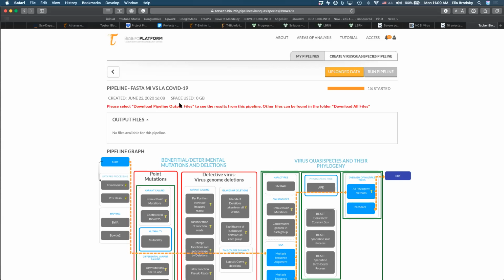So what would be really great for the next time is for all of you to have some sense of how your choices about the data that you want to select are reflected in the results of your analysis pipeline, and what can we ask about the meaning of the results that you get, okay?